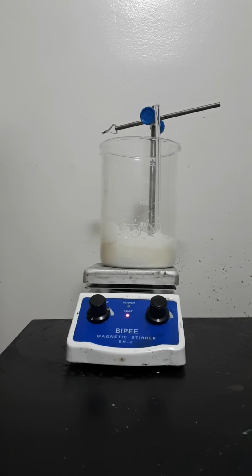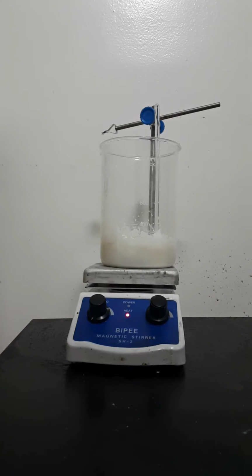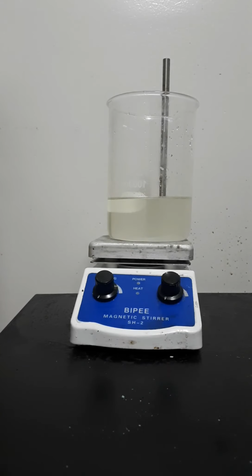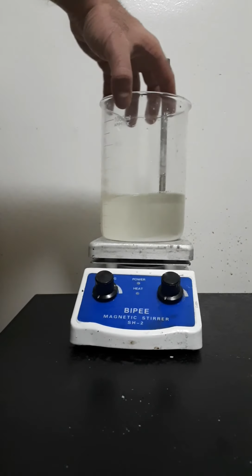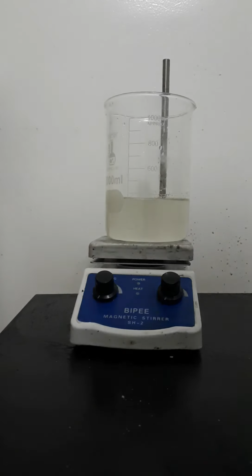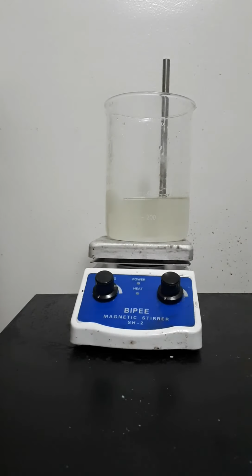Okay, now I'm going to heat up my calcium nitrate and add about 200 milliliters of water. The amount of water doesn't really matter as much. It's just to dissolve all of it. Now all of the calcium nitrate is dissolved in water, and it's time to add the sulfuric acid.